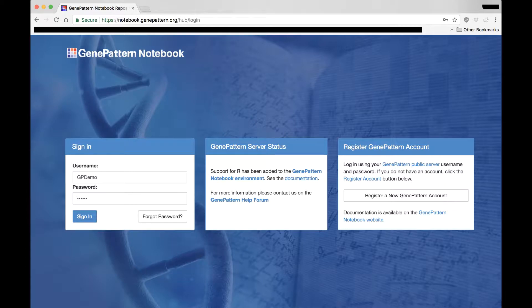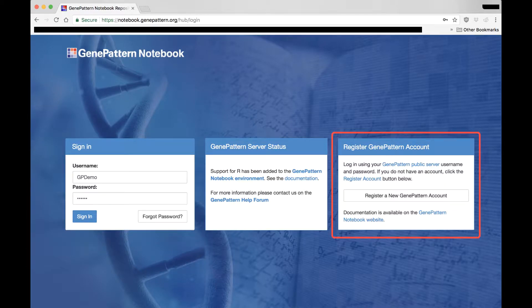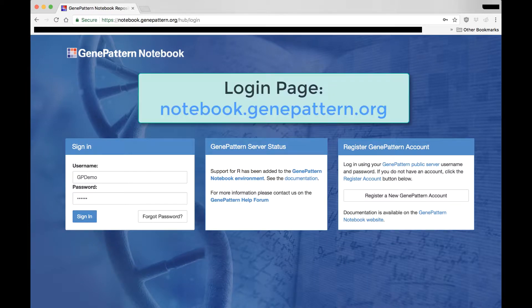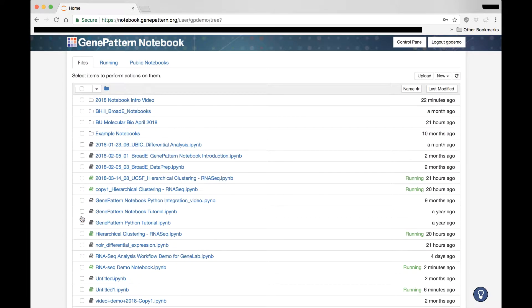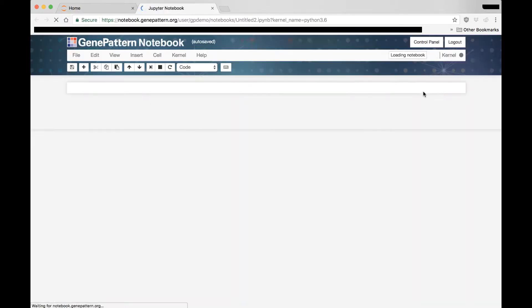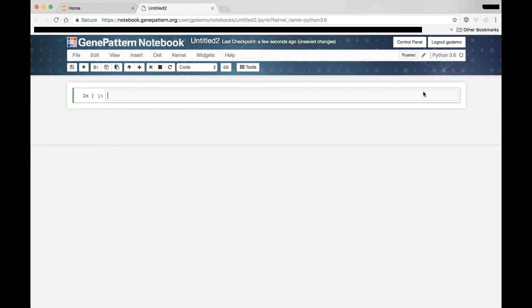The first thing we need to do to create our notebook is log in, or register, from the notebook repository's login page, found at notebook.genepattern.org. Once logged in, pull down the new menu and select Notebooks, then Python. This will create a new GenePattern notebook which will open in a new browser tab.